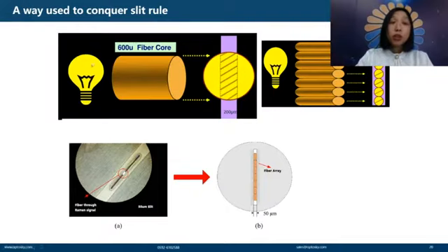And so the slit size can affect the performance. So how can we solve the slit paradox relationship with resolution? The engineers think about this: the yellow striped part is the efficiency that can be obtained from the slit.